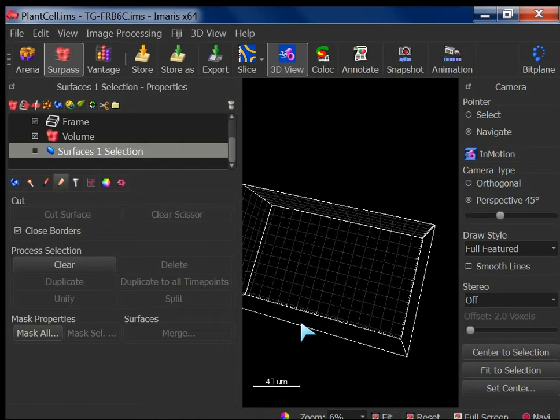If I start from the nuclei staining and segment nuclei, I create a mask of nuclei and lay that mask over the foci channel. Then I don't care about what is happening in the background, because that background has already been gotten rid of because of the DAPI. Right? So there are different scenarios where you can use such an option.